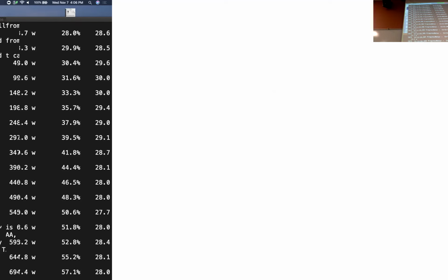So if you're calling a SNP in just one diploid individual, you can basically tell the haplotype caller in GATK, if you see anything that's more than two haplotypes, get rid of it, because it's probably a paralog. We're coming back to the old story of the paralog again, right? But it's a little bit more complex once you have a larger population, right?